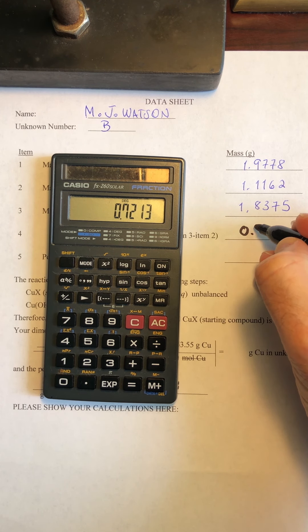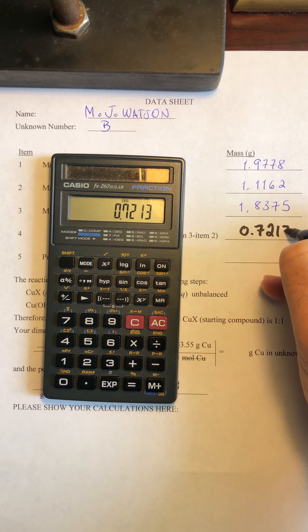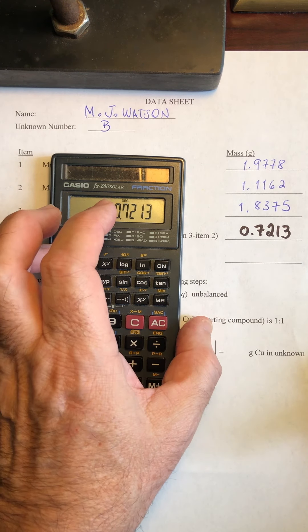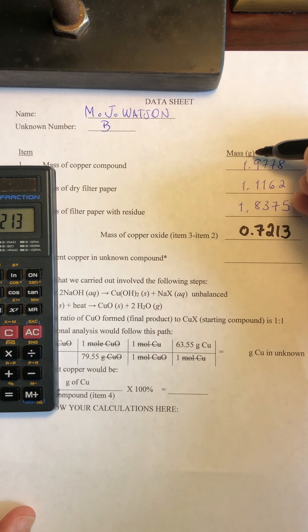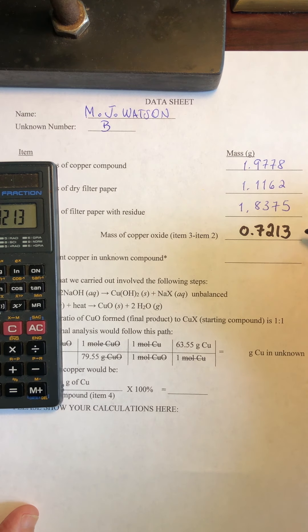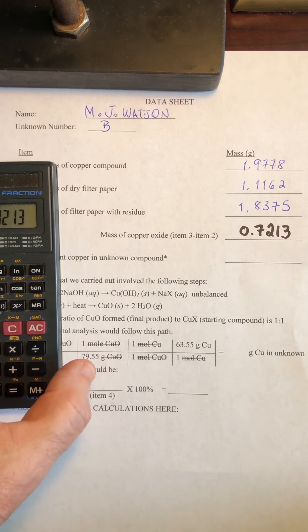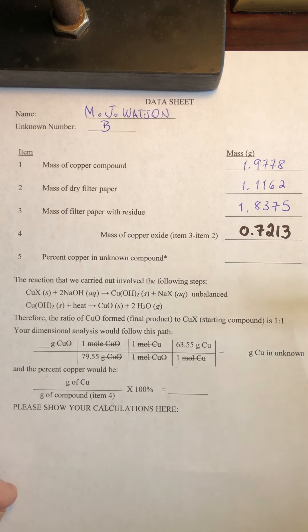So just so it can be more easily visualized. So the mass of copper oxide product is in here. And since already the column has the units in grams, I don't need to repeat the units in here.